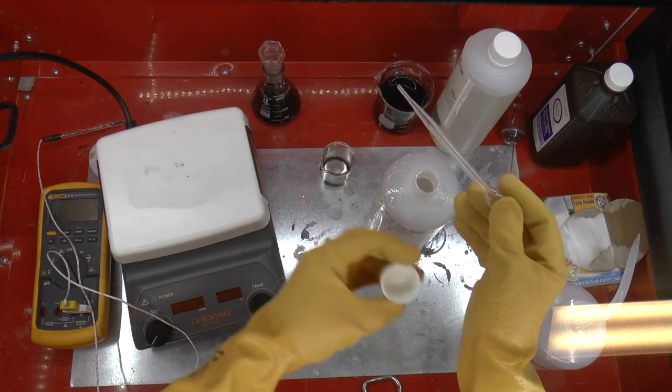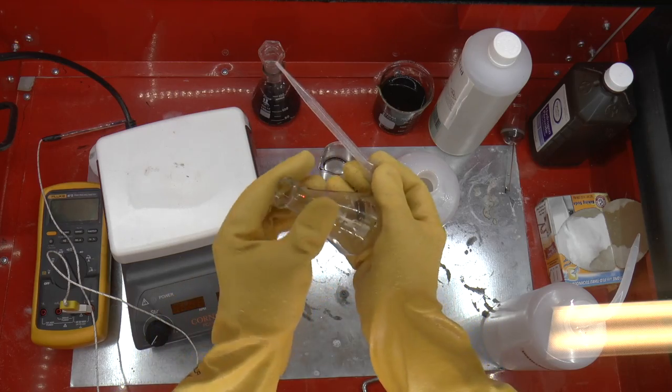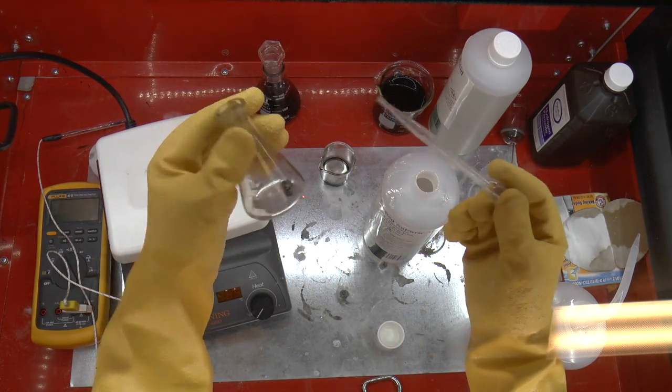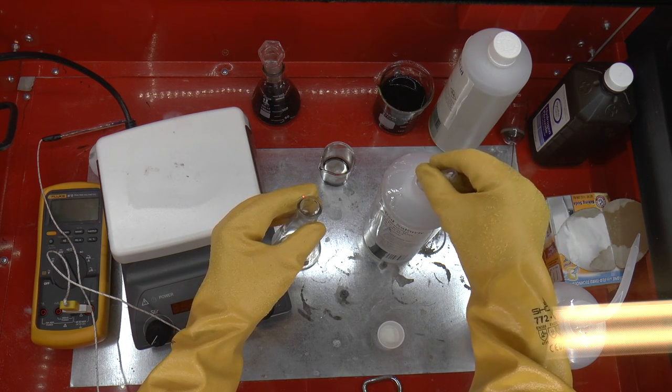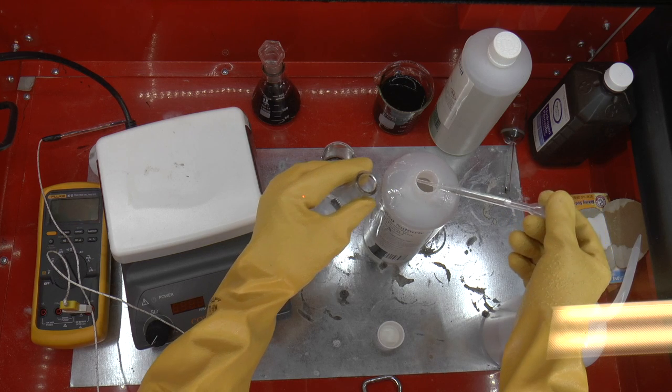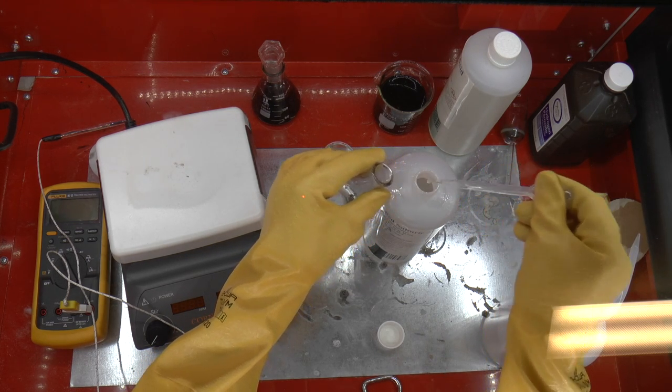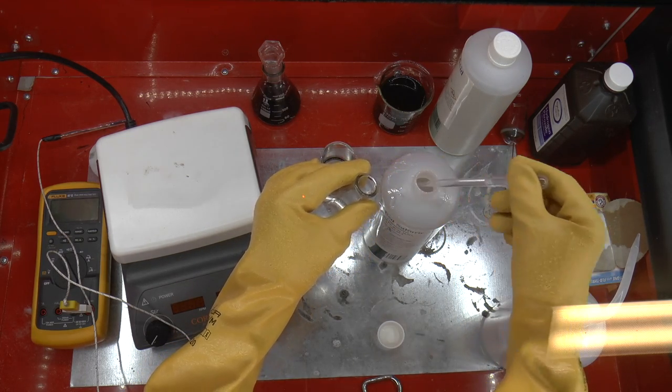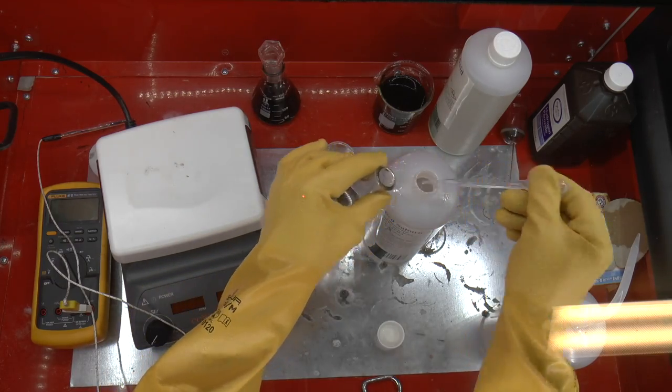We're just going to dump some in, about 2 or 3 milliliters at a time, up to about 20 milliliter level. This is just enough to cover the chip. So here we go with the first 2 or 3 milliliters. This can get boring pretty quickly, so we're just going to speed up time and drop some acid into the beaker.